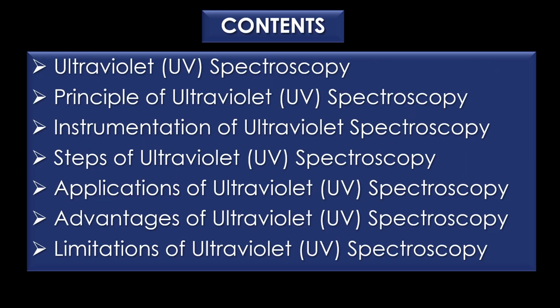This video will contain the following contents. First, an introduction about ultraviolet spectroscopy, followed by the principle of UV spectroscopy, instrumentation of UV spectroscopy, steps of UV spectroscopy, applications of UV spectroscopy, advantages of UV spectroscopy, and finally limitations of UV spectroscopy.